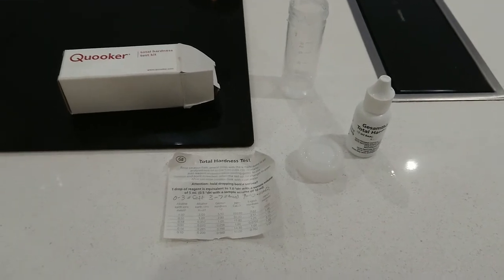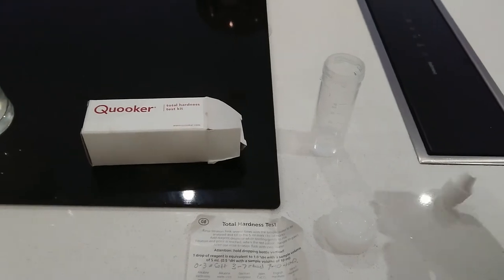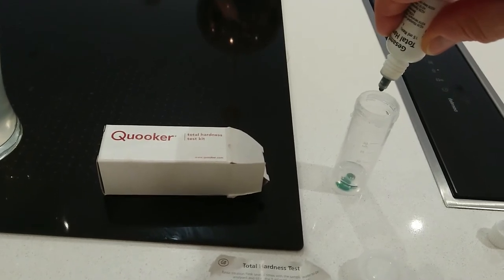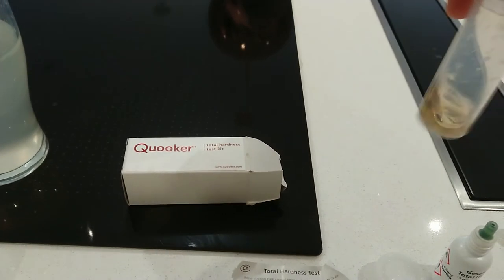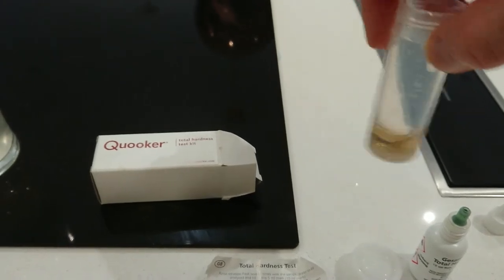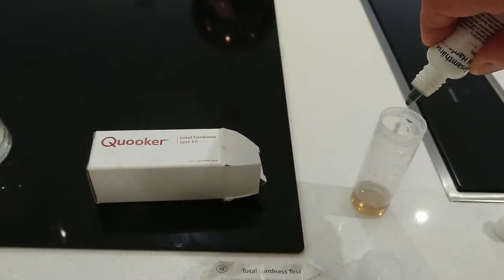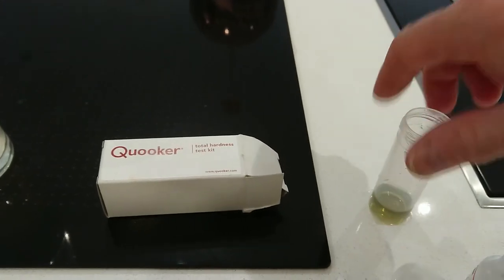I'm gonna take the top off of this and then hold it vertically. I'm gonna drop three in straight away just because I know three means it's soft. So if it's blue-green now, it's soft water. It isn't as red as it could be, but then I am testing it. I've got four - should do it with two hands obviously. That's starting to turn green.